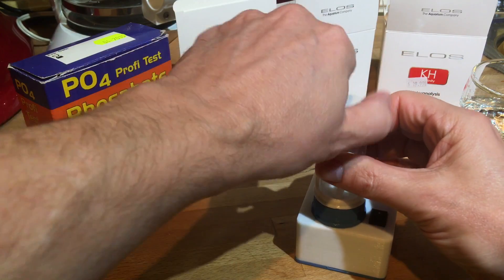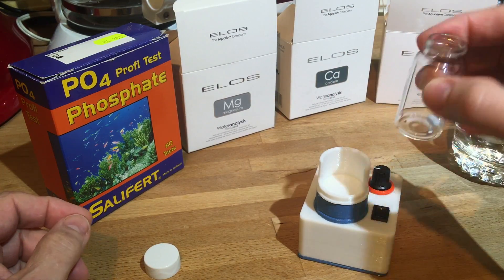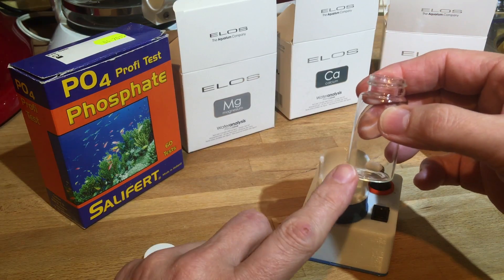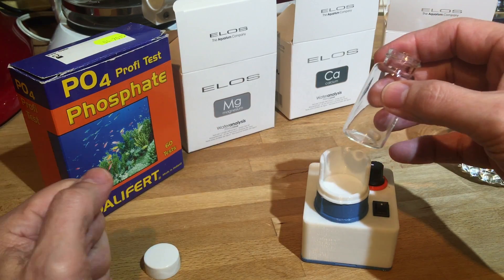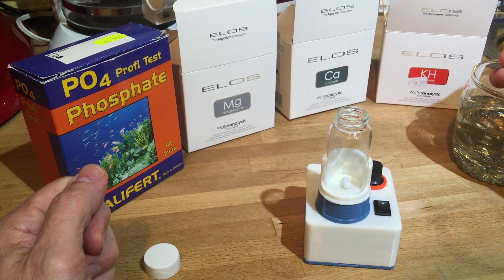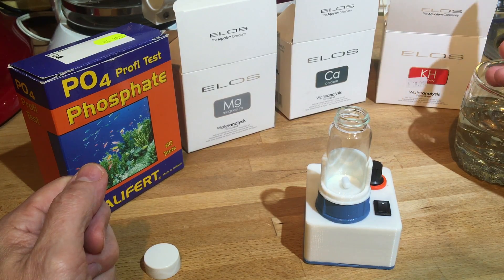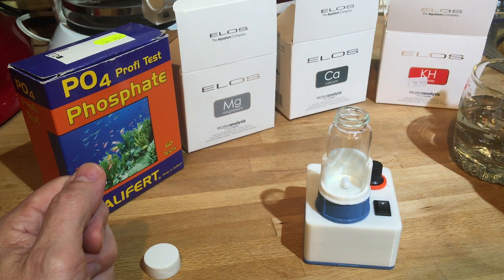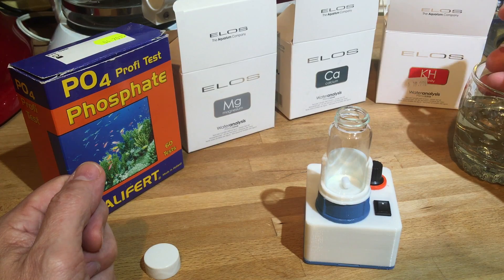I asked for extra beakers because it was coming from overseas — I thought what if one breaks — but it got here perfectly fine. I'm told it works with the Salifert beaker as well, but we'll try it with this one. Normally I would do two and a half milliliters for an alkalinity test using the ELOS, but this time I'm going to do the full five milliliters and use more solution for the test.